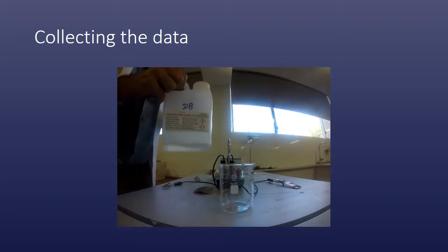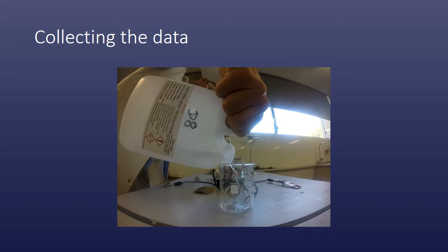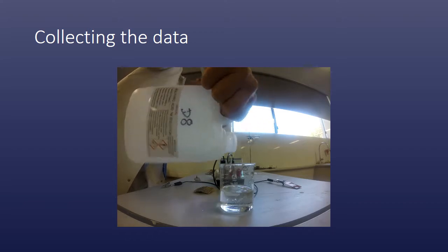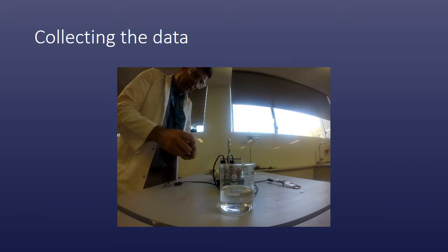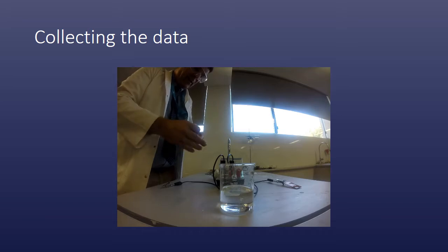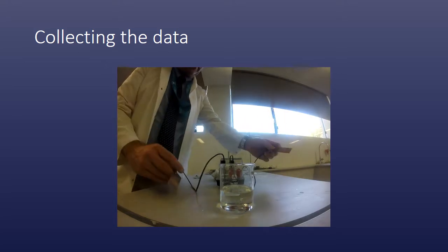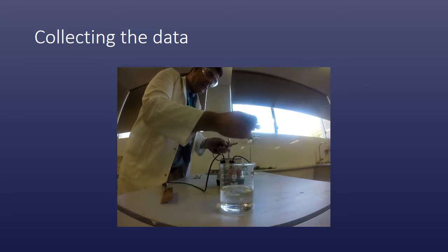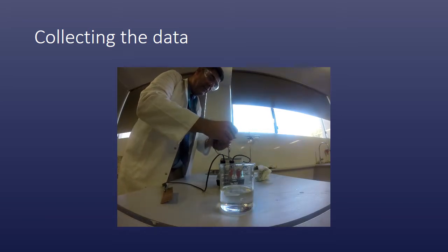Some sulfuric acid. And just put that in. And this time I'm going to have both of the electrodes being copper. See if that makes any difference to my voltage. Remember, it was about 1 volt the previous time. That one's still damp, so we'll just dry that and give it a bit of a clean. See what happens this time.